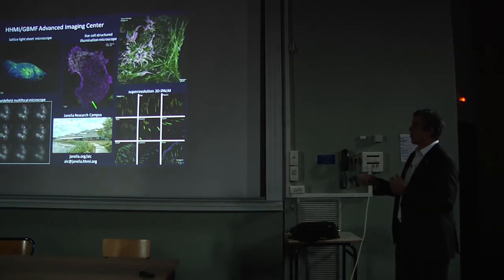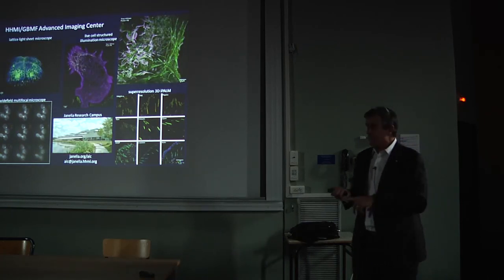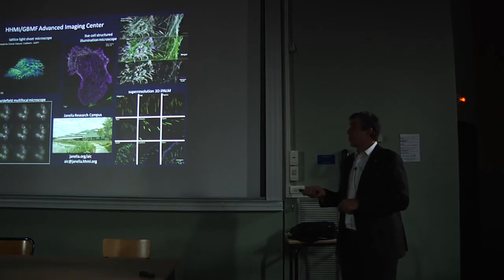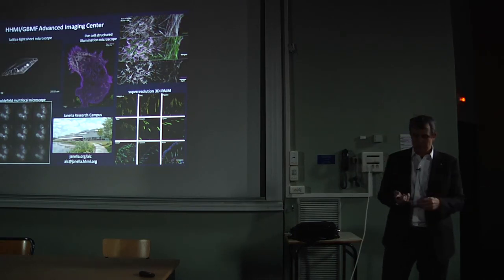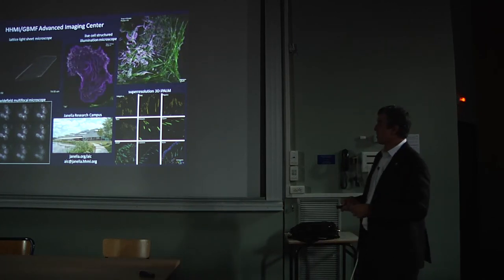But what we've done to try to get these tools in the hands of biologists was, first off, we've created an advanced imaging center where people can come, and we have clones of all of these instruments that I've described for biologists to use. And they come for usually a week or two at a time. They go away always with lots of data.